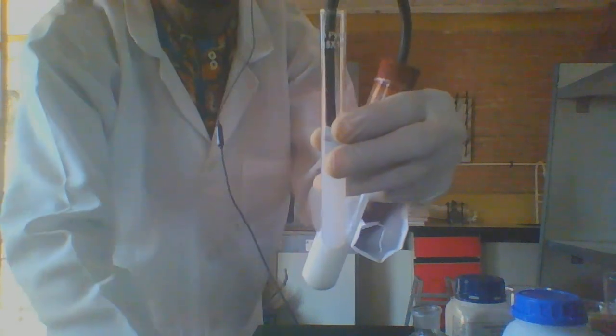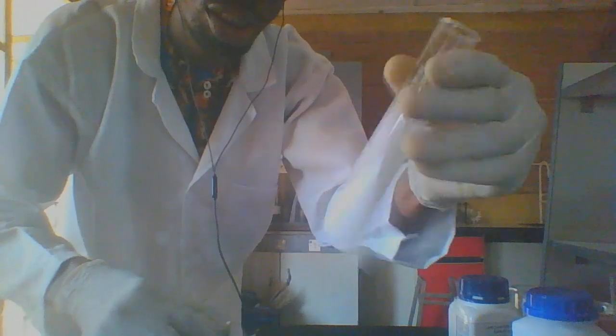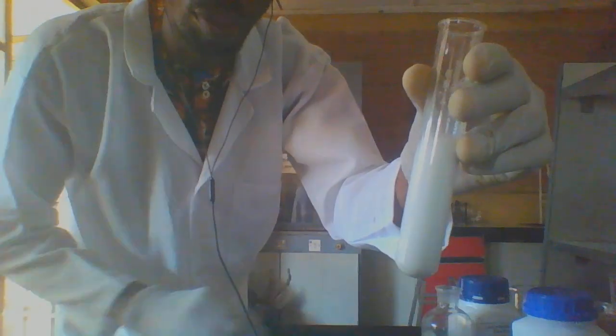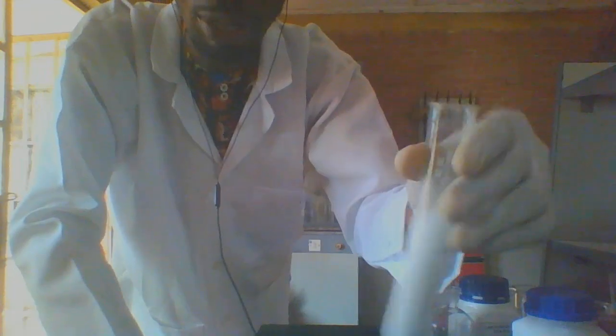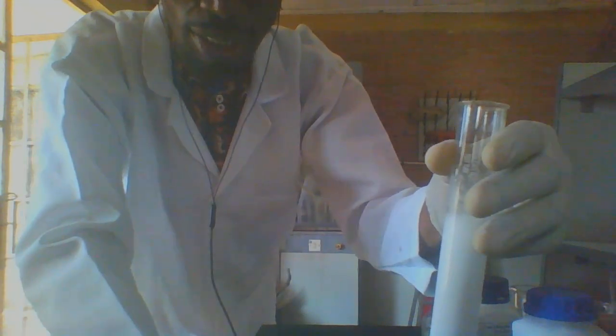This would continue, showing that there is a lot of carbonate inside here. Now, I want to add more acid just to make sure that all the carbonate is gone. I will allow some seconds for the effervescence to cease, then I will come back with the filter.